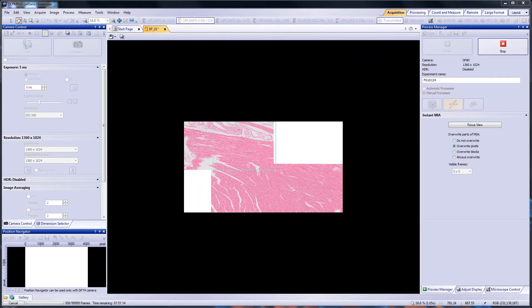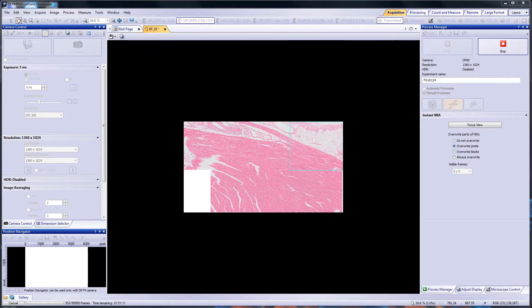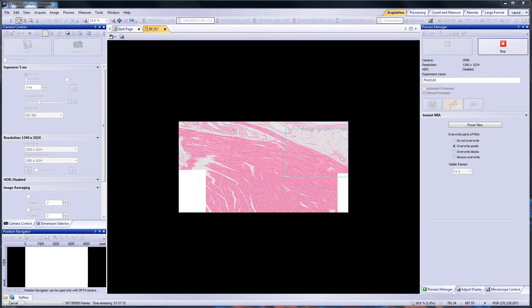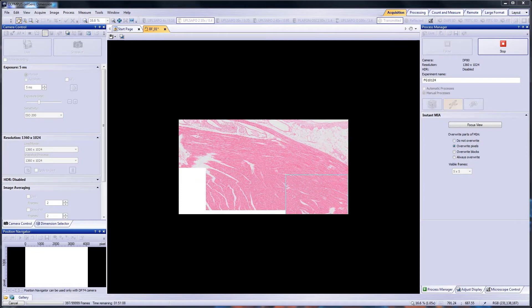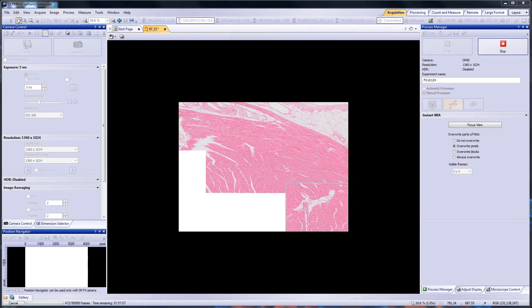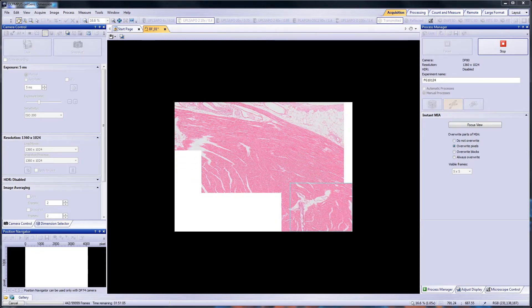The Instant MIA acquisition process functions best with a brightfield observation method. Today, we will use a tissue sample stained with hematoxylin and eosin.